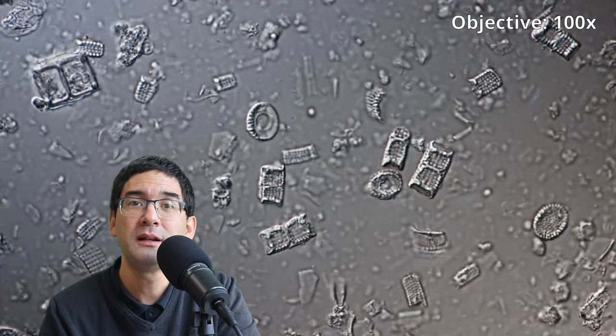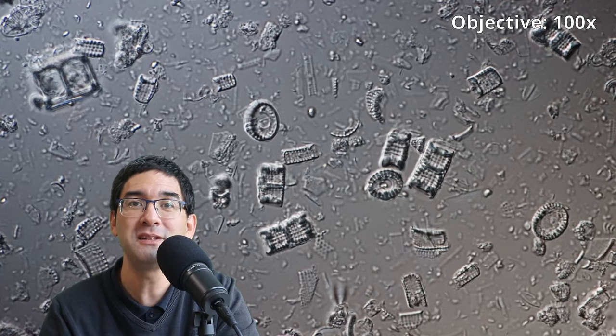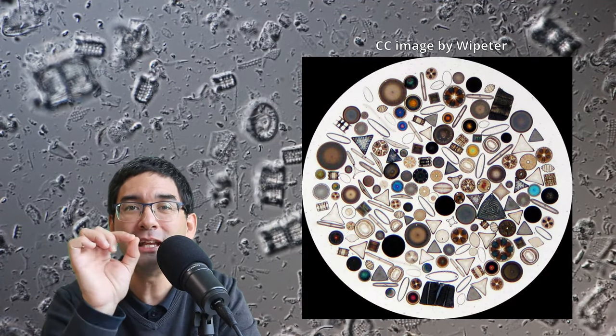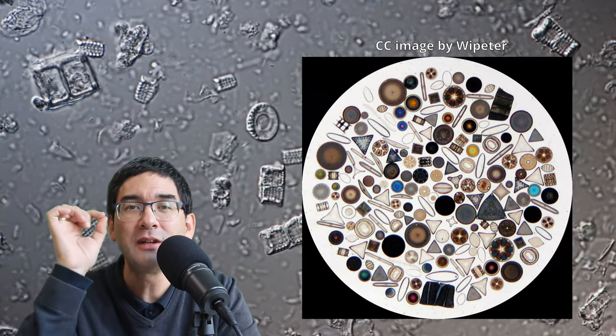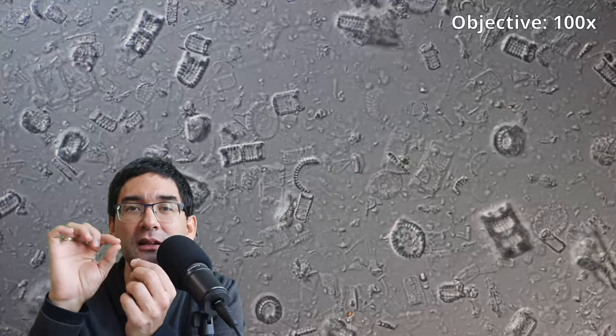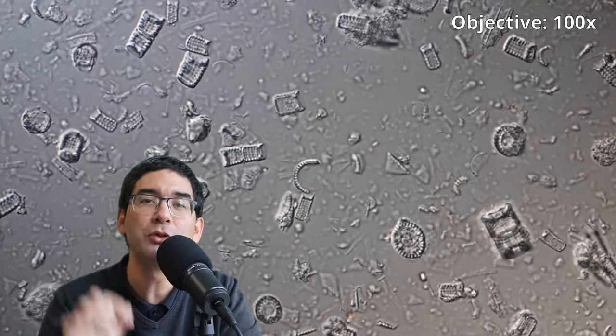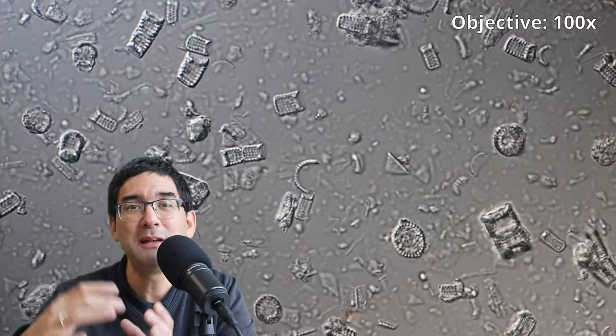Those diatoms in the 19th century, this was a popular hobby among microscopists to make permanent slides using those diatoms, but by arranging the diatoms manually using an eyelash. So the eyelashes, they are very pointed and thin on the end. And what you can do is you can under the microscope manipulate the individual diatoms around. And for this, this way you were able to make beautiful arrangements.